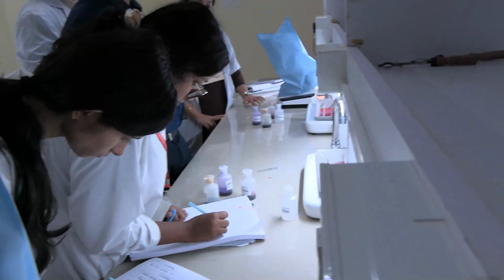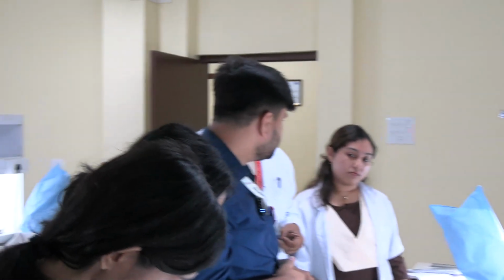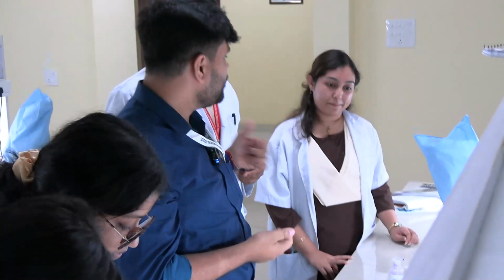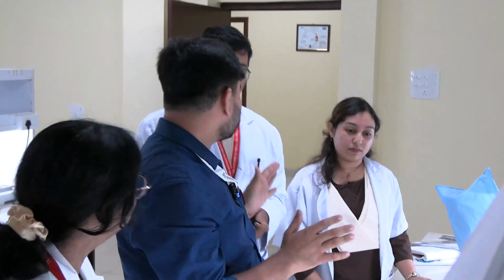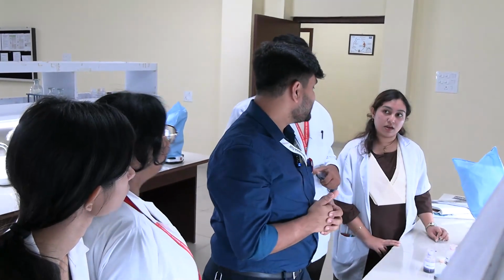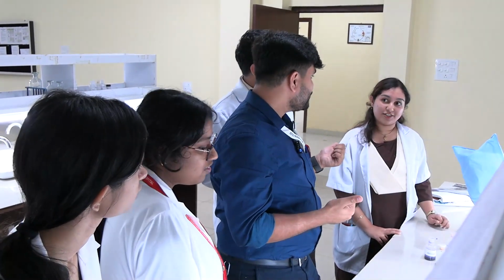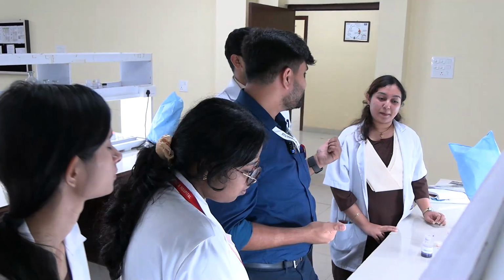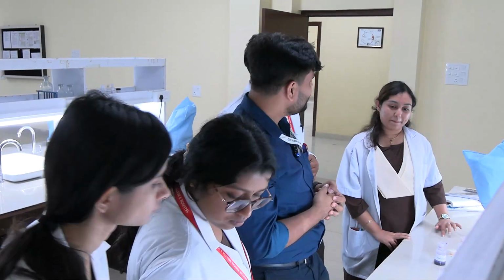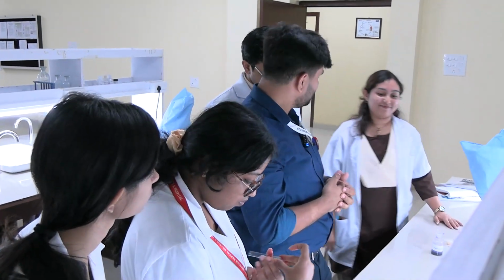And give me some examples of gram negative bacteria. E. coli. Any other? Meningitis. Okay. So these are the Neisseria meningitidis. You're gonna have to tell the full name. Okay. You are not a consultant. You are a student, so you have to tell the full name. In case of E. coli, there is Escherichia coli. There is Entamoeba coli also. Entamoeba coli is a parasite. E. coli is a bacteria. So how do I know that you have told the right one? So as a student, you have to answer properly.